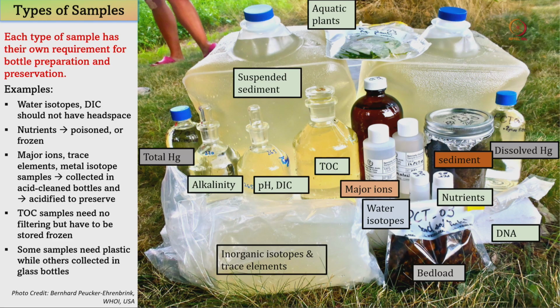So, to prevent such precipitation from happening, we add a few drops of acid to the sample. Okay. Then in the acidified sample there is no precipitation, all the cations are in their ionic form, and they will not tend to precipitate out.